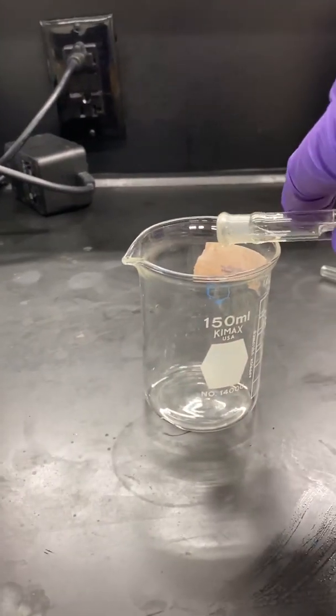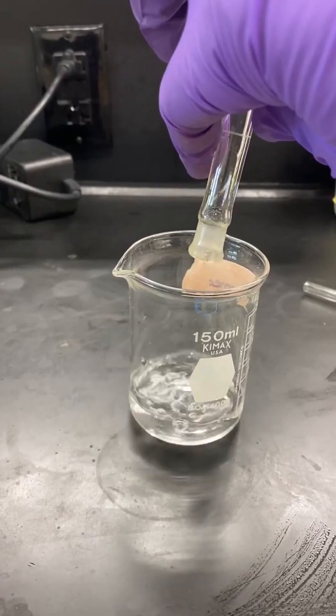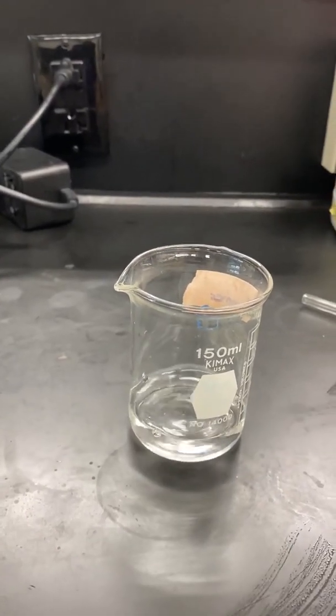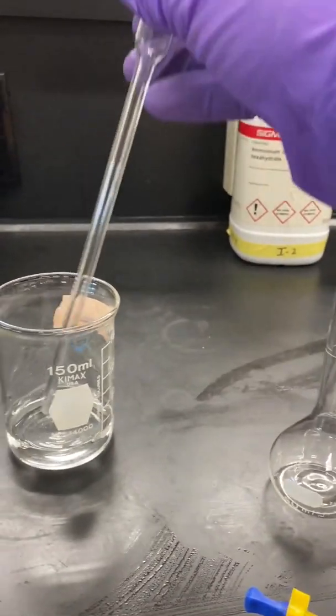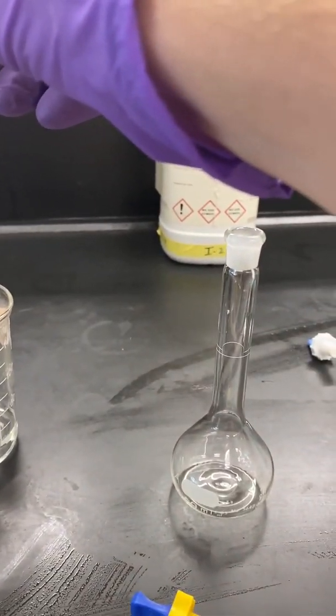Pour Stock 1 into a clean, dry beaker. Then pipette 10 milliliters of Stock 1 into a 50-milliliter volumetric flask.